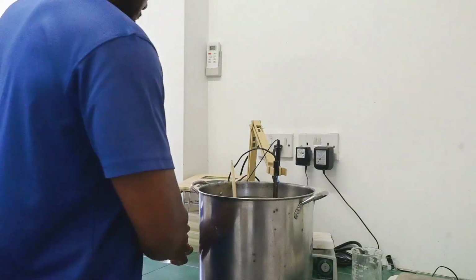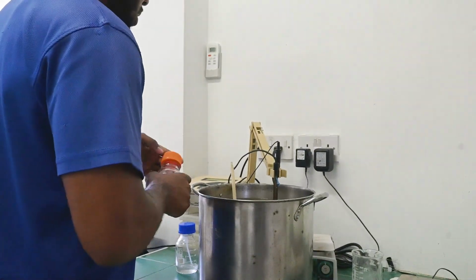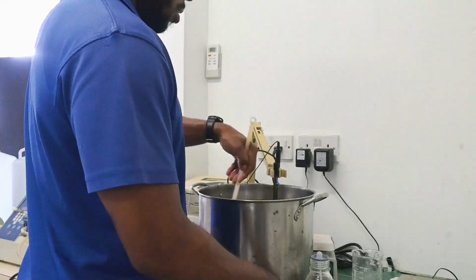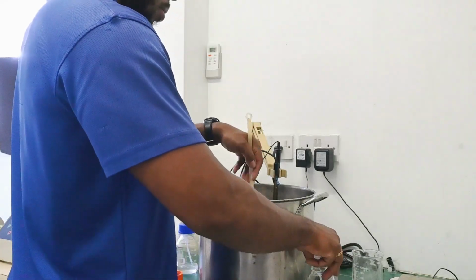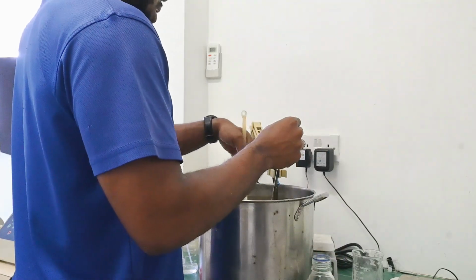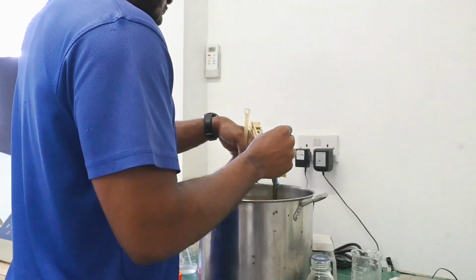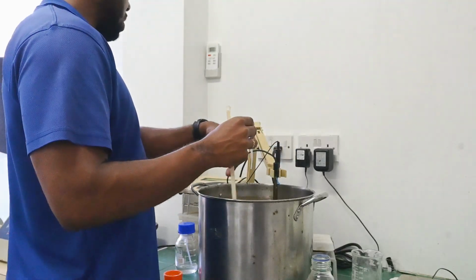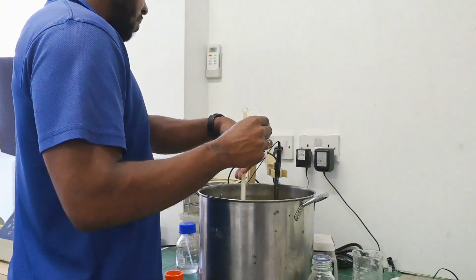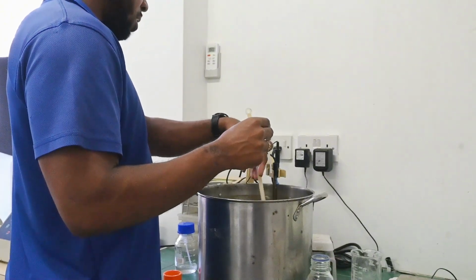So we're going to add hydrochloric acid to bring it down to 5.7. Use the dropper to add the desired amount. Every amount you add, you check the reading on the pH meter to see how the level is going down, to know how much to add.